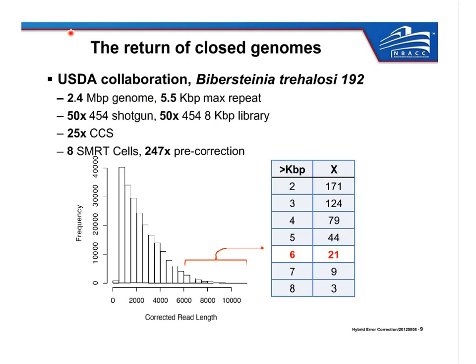And what we did is we basically just took the tail of the distribution. The PacBio sequencer produces an exponential distribution of read lengths, and we were interested in only the long reads, because if we want to assemble these 5,500 base repeats, a 2,000 base read isn't going to help us. Right? We only want the 6,000 base reads, because those will tell us the exact structure of the repeat with enough unique spanning sequence on either side so that we can unambiguously place it in the assembly graph, like Adam showed in one of the early slides.